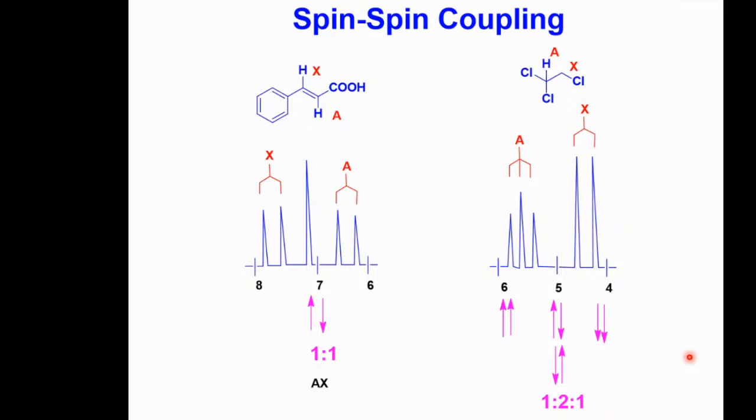Okay, so I have given a quick overview of chemical shift, which all organic chemists should be familiar with. Now let us quickly move on to coupling constant. Again, I have not discussed much theory behind chemical shift. Similarly, there is a lot of theory behind spin coupling as well, but my presentation today is concerned more with interpretation rather than theory. I am sure you have been exposed to the theory of spin-spin coupling already. So let us take a couple of examples and discuss.